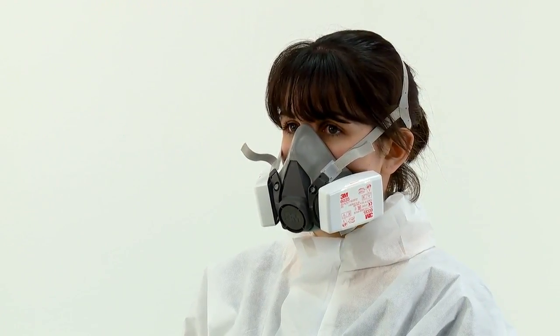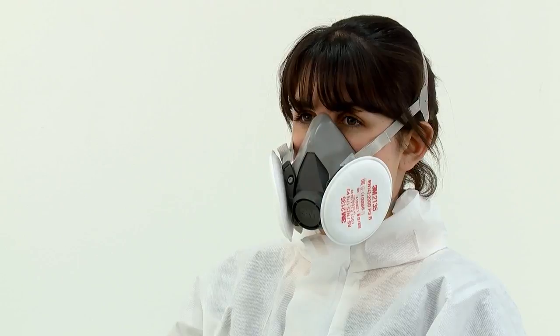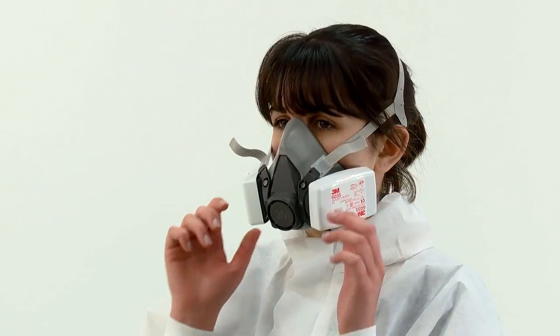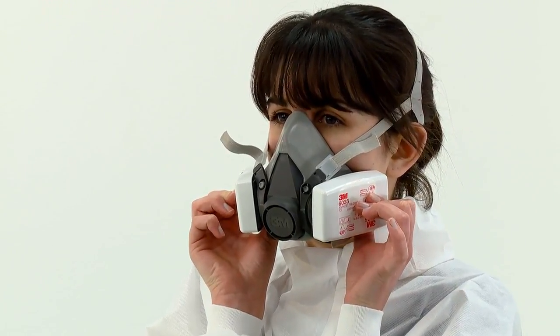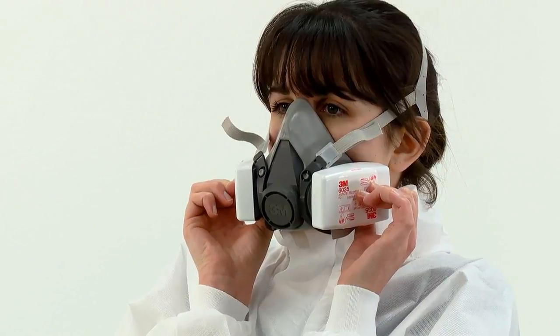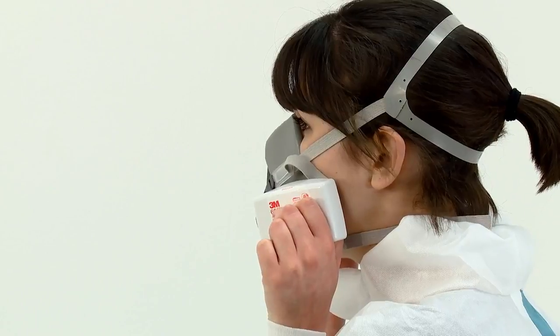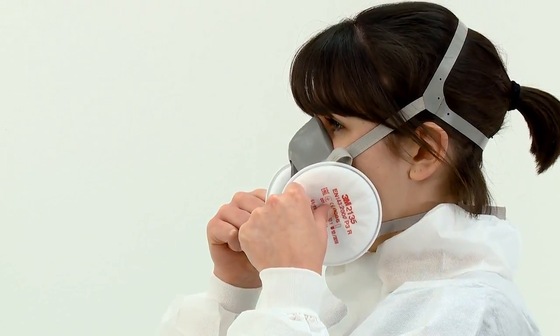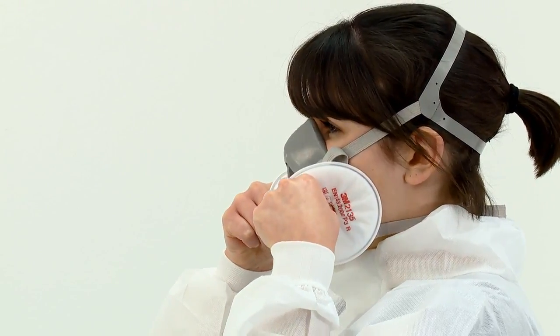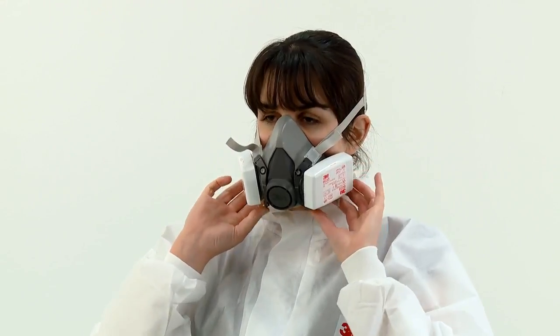The seal of the respirator on the face should be fit checked before entering the workplace. If 6035, 6038 or 2000 series particulate filters have been fitted, a negative pressure fit check should be performed. For 6035 or 6038 particulate filters, press the filter cover and filter body together between your thumb and fingers, taking special care to squeeze the filter in the middle. For 2000 series particulate filters, press your thumbs into the central indentation of the filters. In both instances, this seals the filter and restricts airflow. Whilst continuing to seal the filters, inhale gently and hold your breath for 5 to 10 seconds. You should feel the face piece collapse slightly. If it does not and you detect air leaks at the seal, adjust the fit, taking extra care with the tension adjustment of the straps, then repeat the fit check.